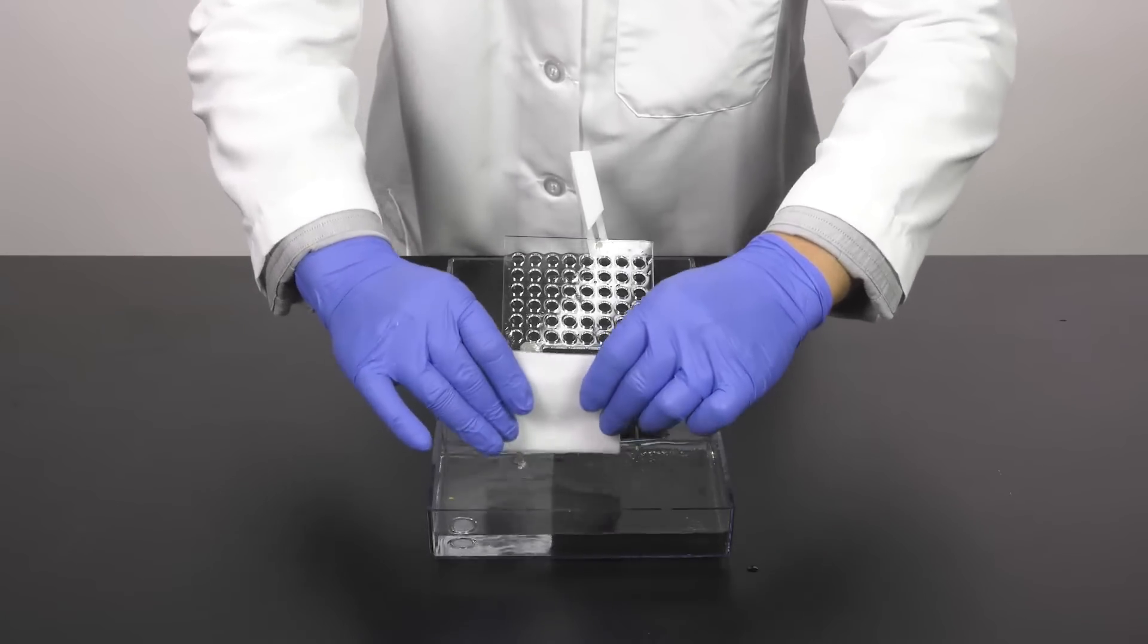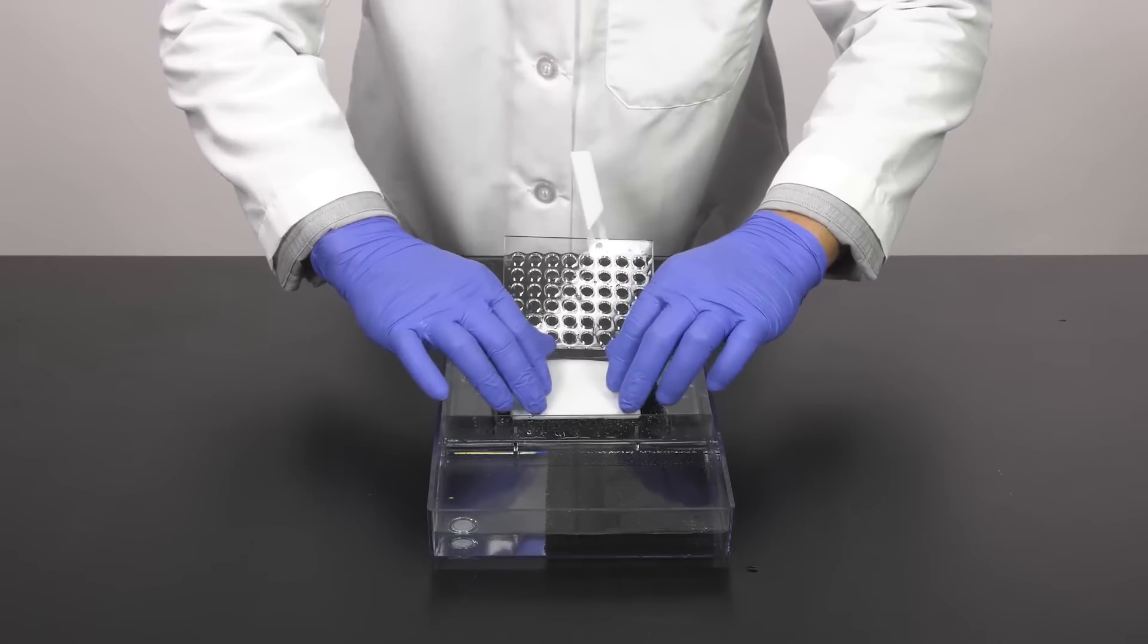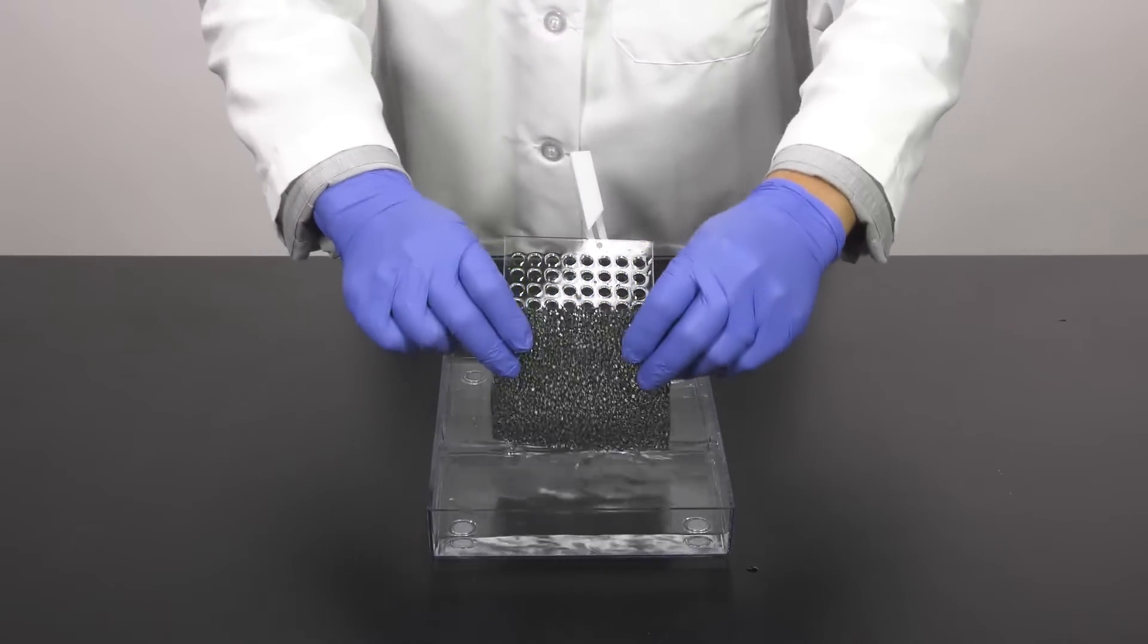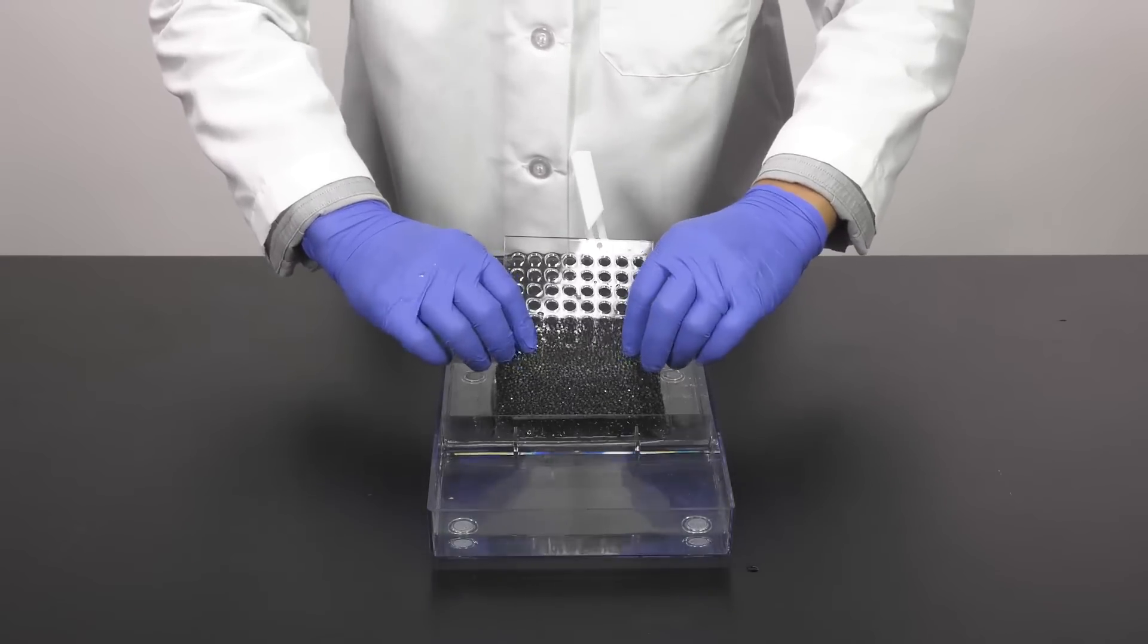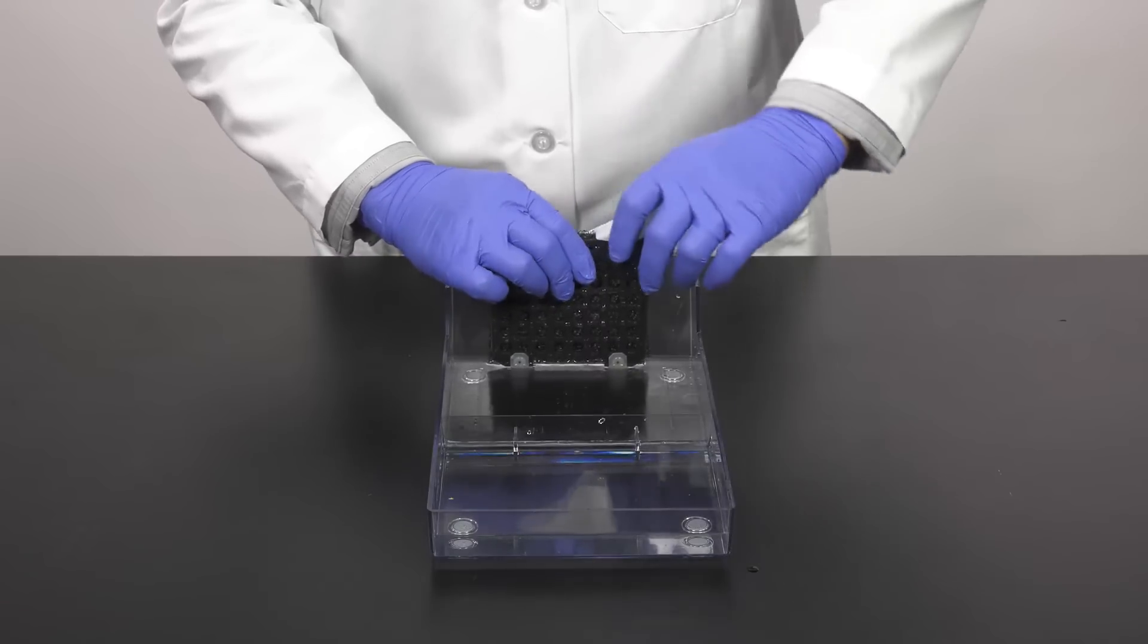Place a second sheet of blotting paper on top of the membrane, then the final fiber pad on top to complete the sandwich. Close the gel holder and secure it with the sliding clamp.